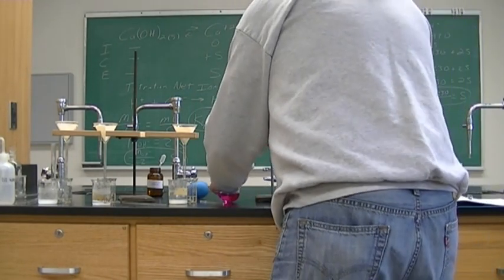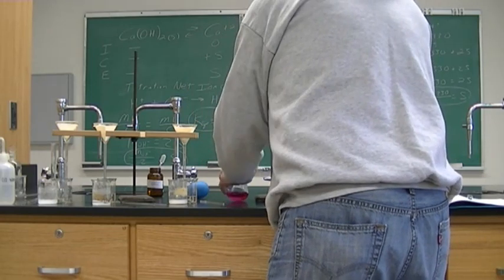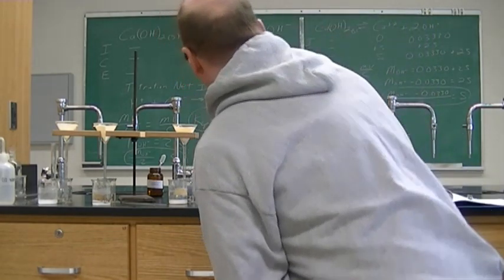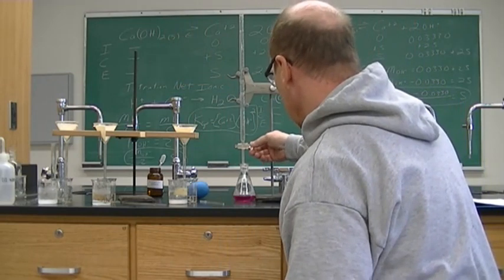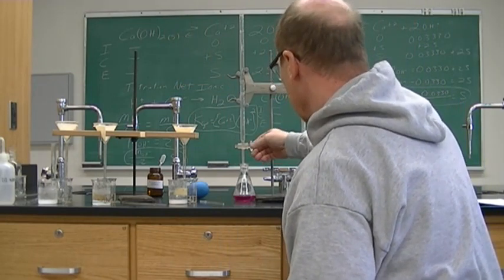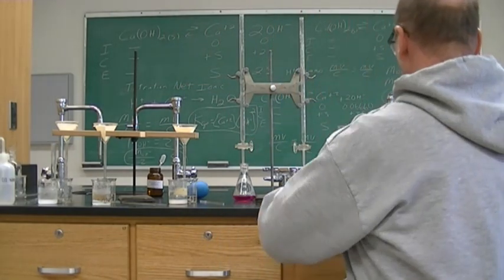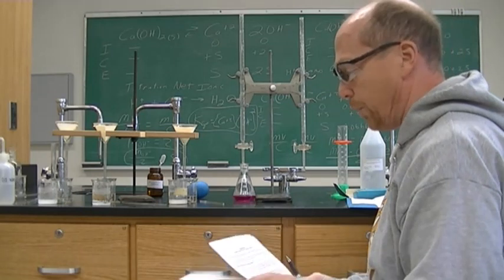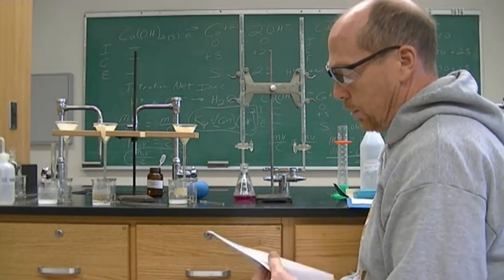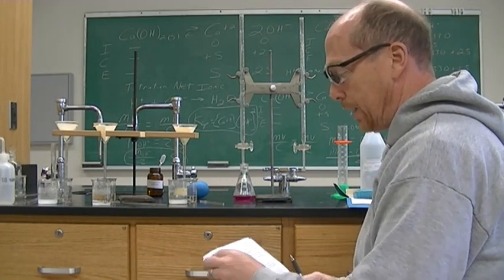All right, so now we are ready to add our HCl. And we want to add this very slowly. I do not want to pass up the end point. I do not want to pipette that again.